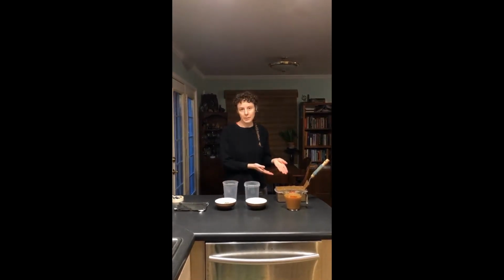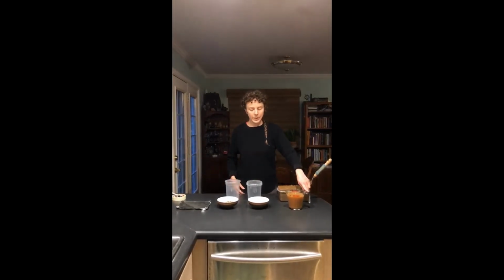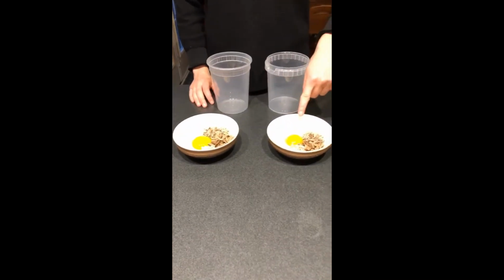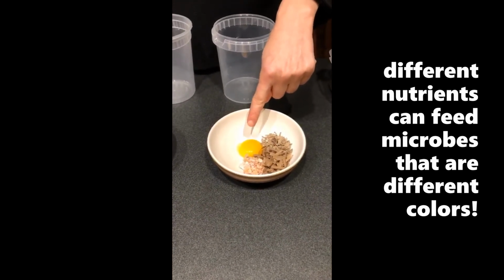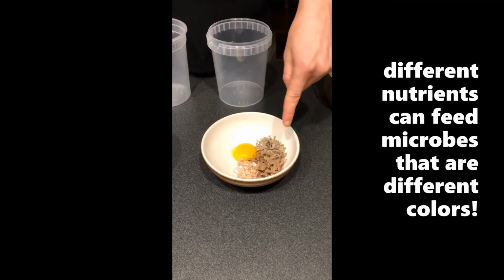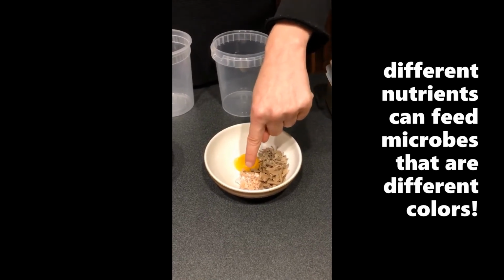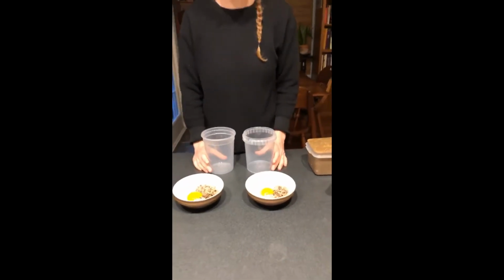Next we have our mud from the middle of Coney, and we've got a nice little trowel to move our mud with. We have water from the middle of Coney, and we have some nutrient inputs. So our nutrient inputs include an egg yolk, which will be a source of carbon and also sulfur. We have, for more carbon, some cut up paper. You could use newspaper. I used some grocery bag handles and grocery bags. And then I also have the eggshell from the egg smashed up. This gives us some calcium.